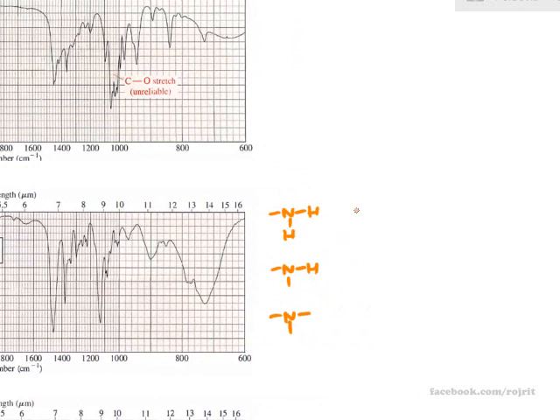Normally, with amine you have hydrogen bonding, so it's broad like this. But the hydrogen bonding of the amine is not as strong as that of the OH. Firstly, OH is very polar. If the OH is very polar, that means H is very positive and O is very negative. The hydrogen bonding is very strong because you have a very strong interaction between positive and negative charge.